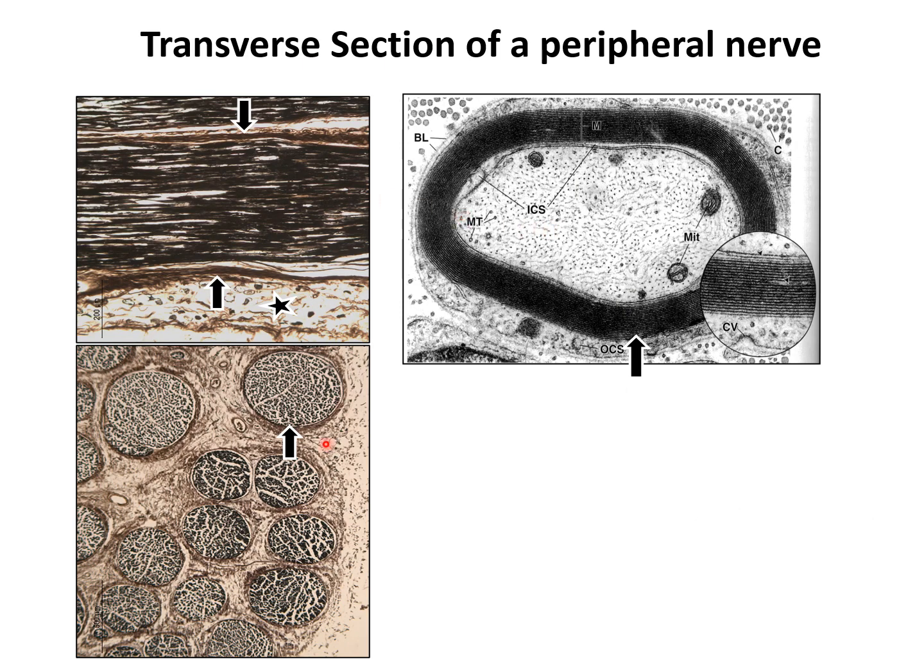This slide shows the transverse and the longitudinal section of a nerve with myelin stain, that is the osmium tetroxide stain. The osmium tetroxide stains the myelin black. One can see the nerve fascicle, and inside the fascicle the darker areas are the myelin around the axon.